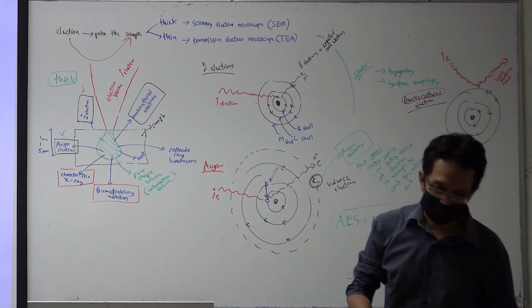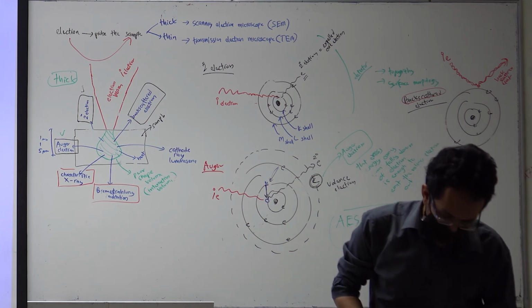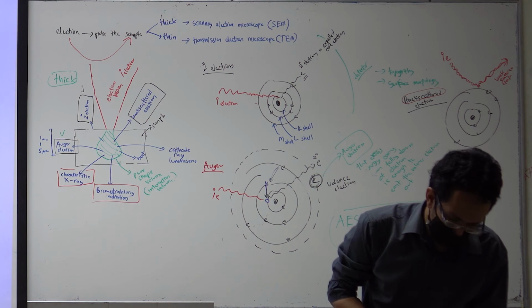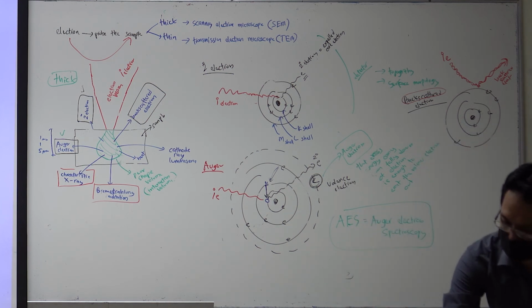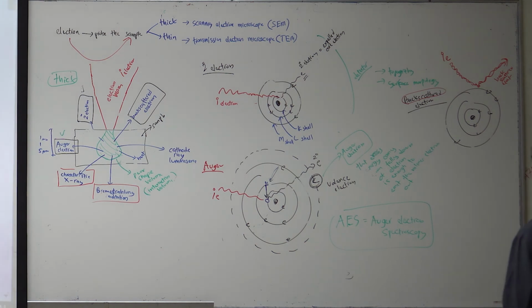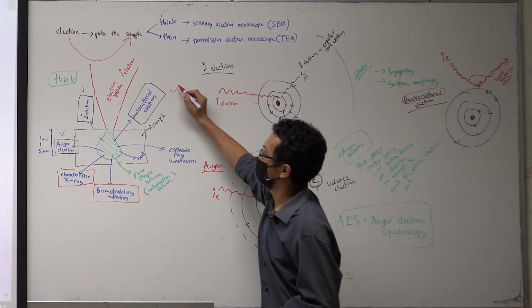So this backscattered electron is basically normally at a big angle, because it just scatters. The concept is just scattering out. Okay, so this is the backscattered electron. So we have done this backscattered electron.